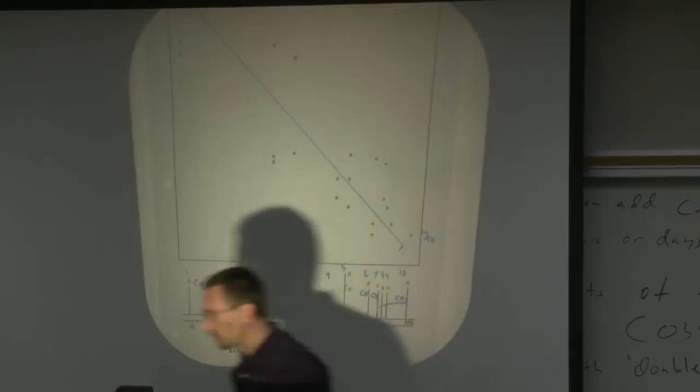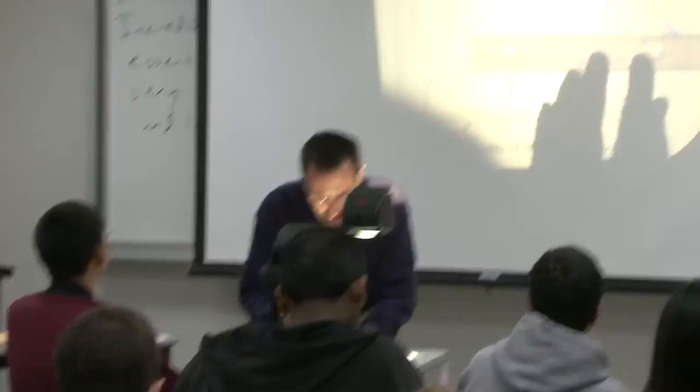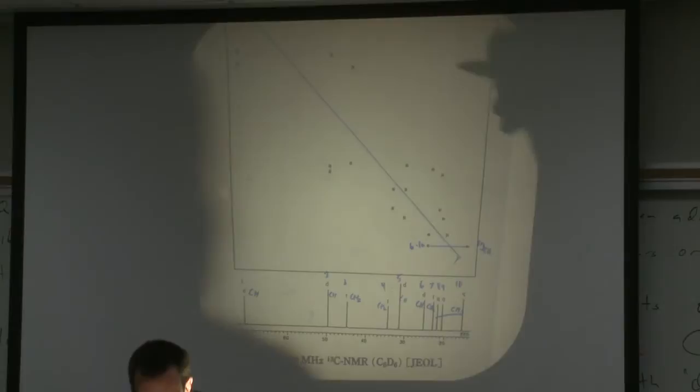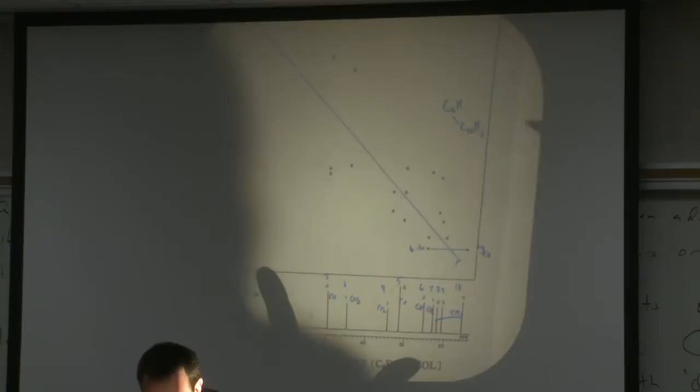All right, so let's start to build up our structure, and we can do so very mechanically. I'm just going to trace my pairs, and you can start anywhere. I'll just start here, and we'll get our cross peaks. This pair becomes 6 to 10. Okay, 6 is a methine, so I'll draw that as C6H, and it's coupled to C10H3. So we're well on our way to building up our structure.